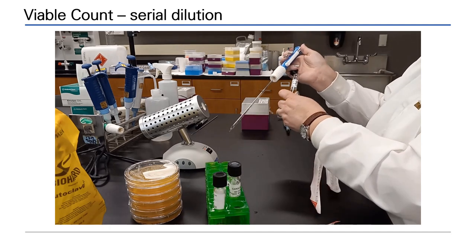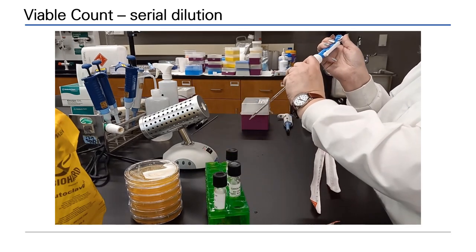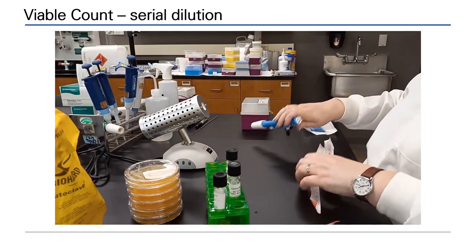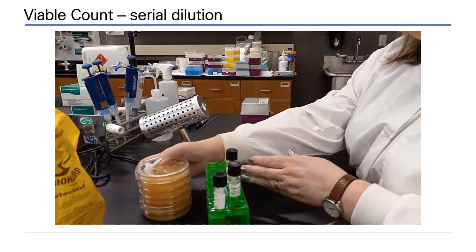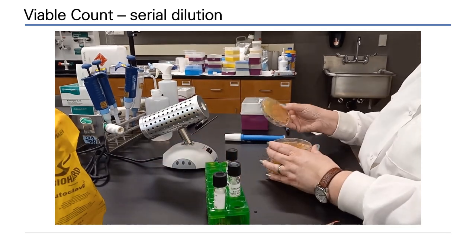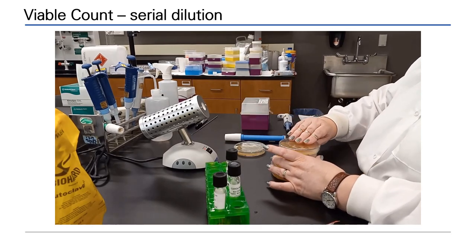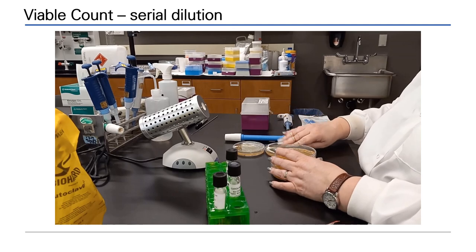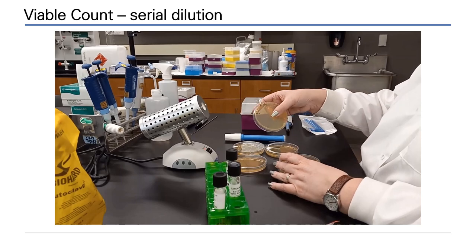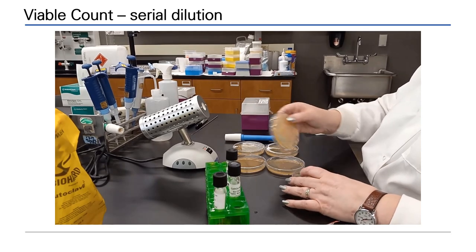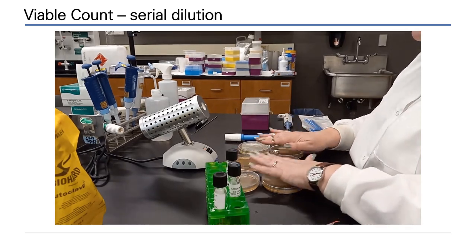Dispose of the last pipette. The serial dilution is complete now. You must move on to the next step of plating the dilutions. Remember, we cannot determine the number of cells in the original sample unless we plate them, incubate them, and allow them to grow as colony forming units. For each dilution, we have two plates. This will allow us to plate the dilution twice, count the number of colony forming units, and average them for accuracy.